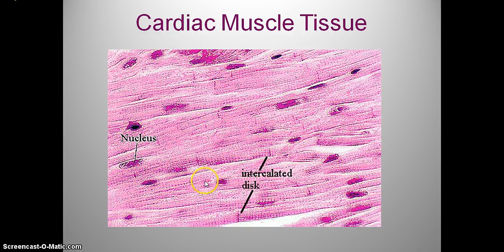This is a cardiac muscle. Notice that a cardiac muscle is like a smooth muscle. It's kind of a hybrid between the smooth and the skeletal muscles. What you notice is that it's a nucleus in the center, but also pay attention to the fibers being kind of branched out, and they're not parallelly aligned like in skeletal muscles.